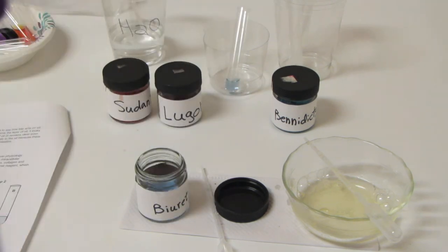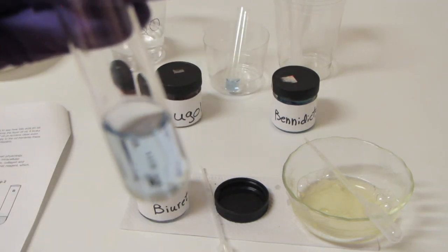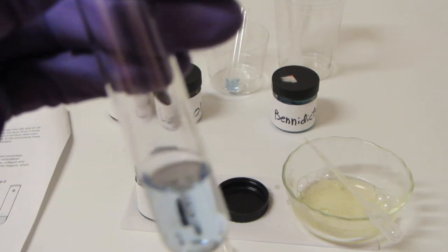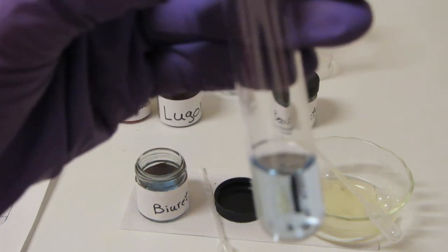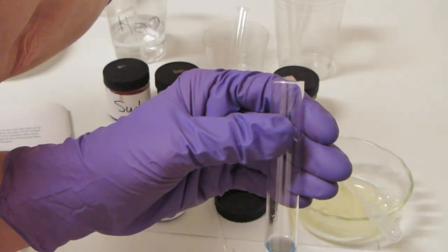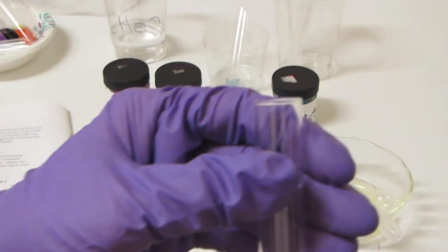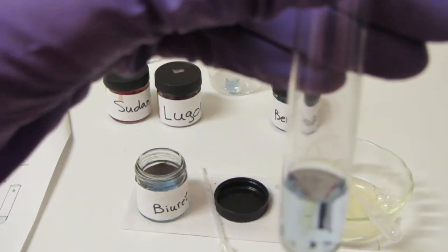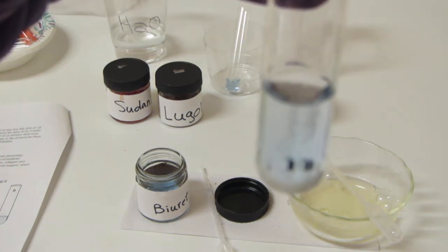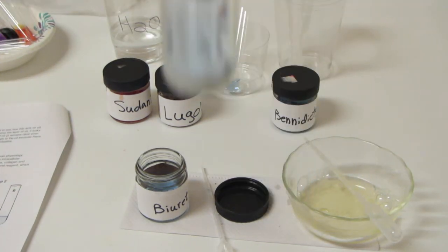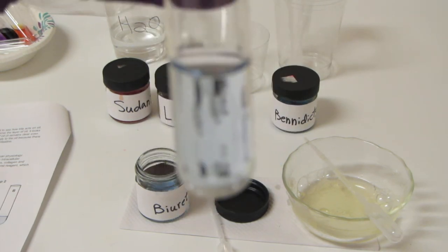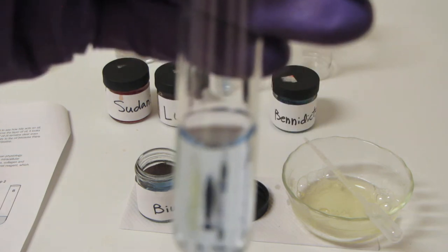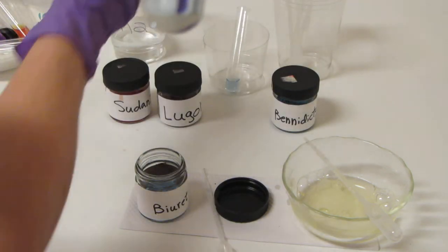So what we're going to do is mix one tube with water as our control and one tube with a protein source and see what happens. First we're going to take some water from my little container and put some water in here. Mix it up a little bit and you can see that there's really not much happening, right? Maybe it looks a little lighter shade of blue because we diluted it out with water.